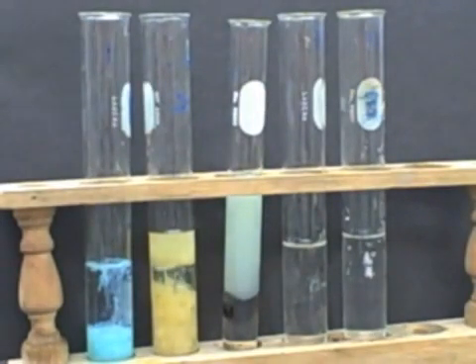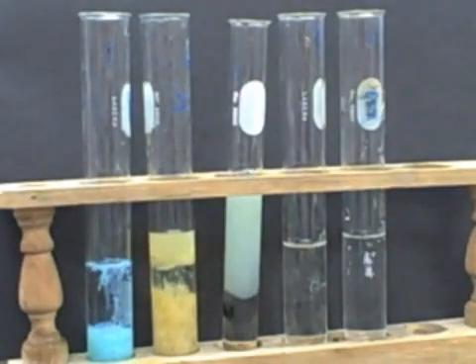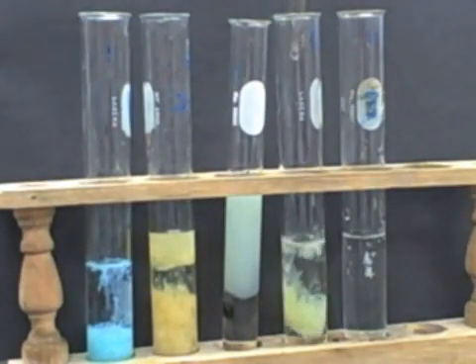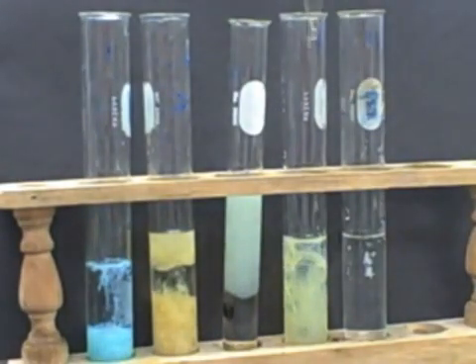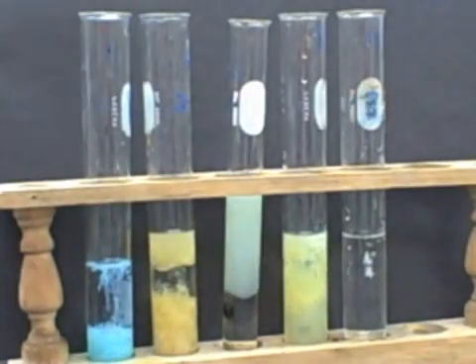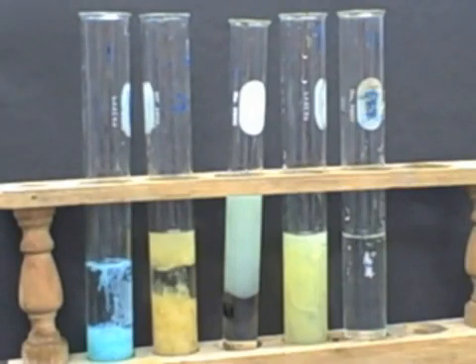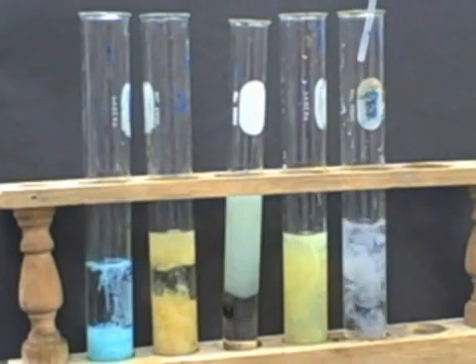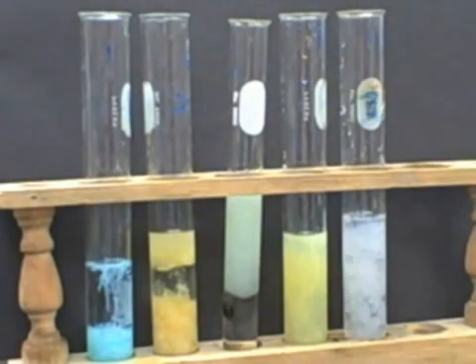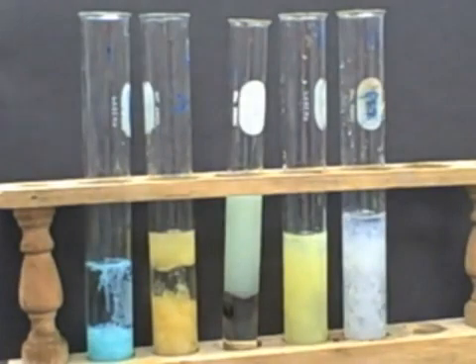And then silver. This is silver nitrate and sodium phosphate. Nice yellow color on the silver phosphate there. That's great, actually. That's not what I expected to happen. Thought it was going to be whitish. Wow, that's great. And now let's see if lead does a similar thing. This is lead nitrate and sodium phosphate. Just a whitish blue precipitate there. So those are our phosphates.